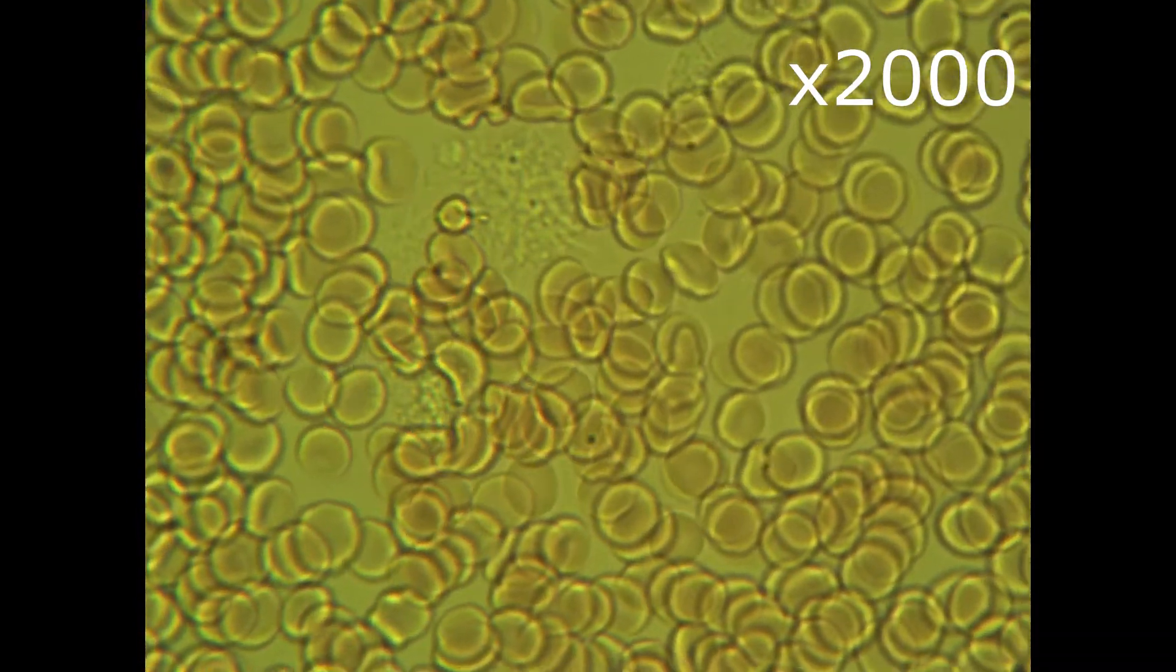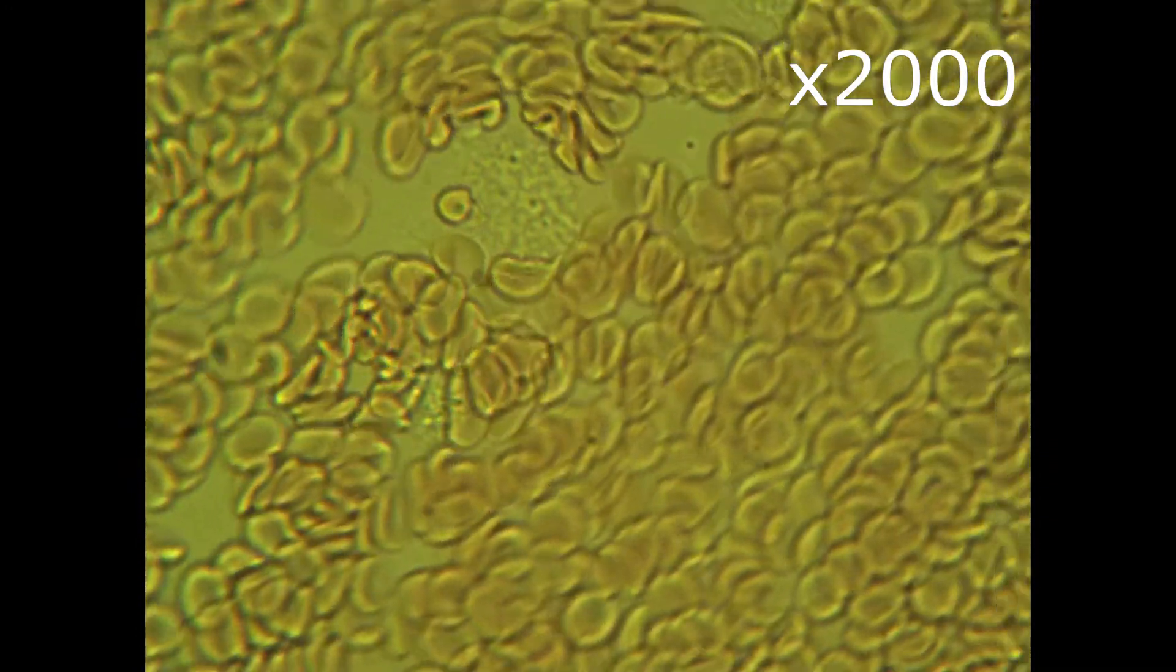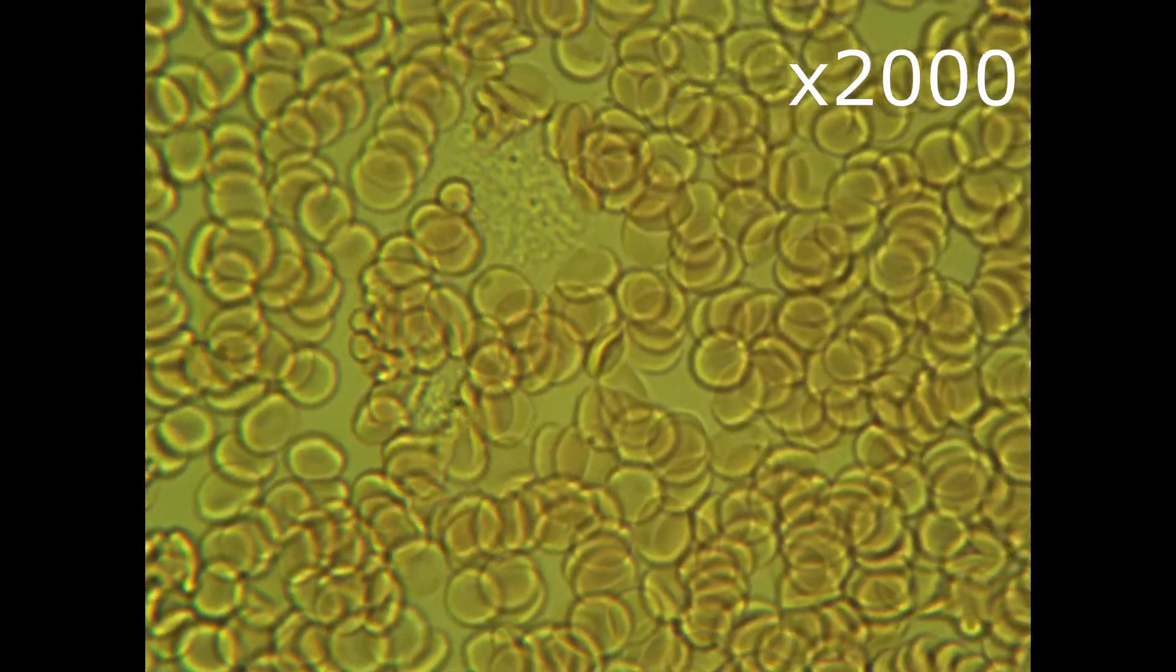So, 40 minutes passed and another hole in a finger. I took the blood sample and put it under the microscope. What you see now is blood zoomed 200 times. We can see that blood condition hasn't changed. There is nothing noticeable for me.